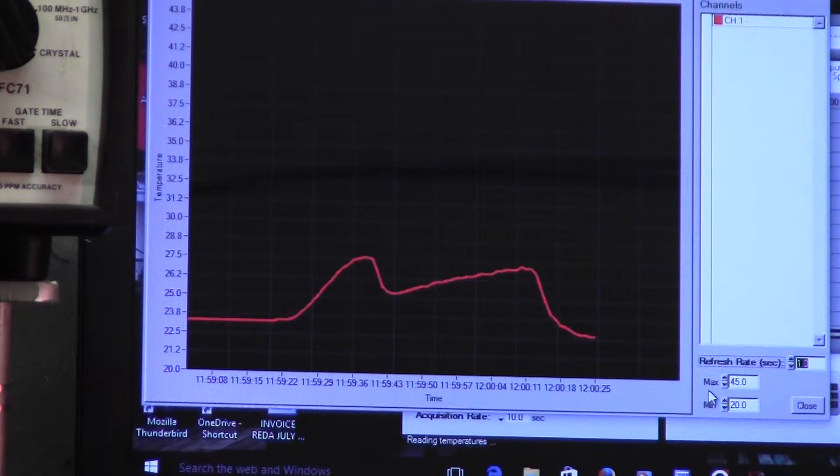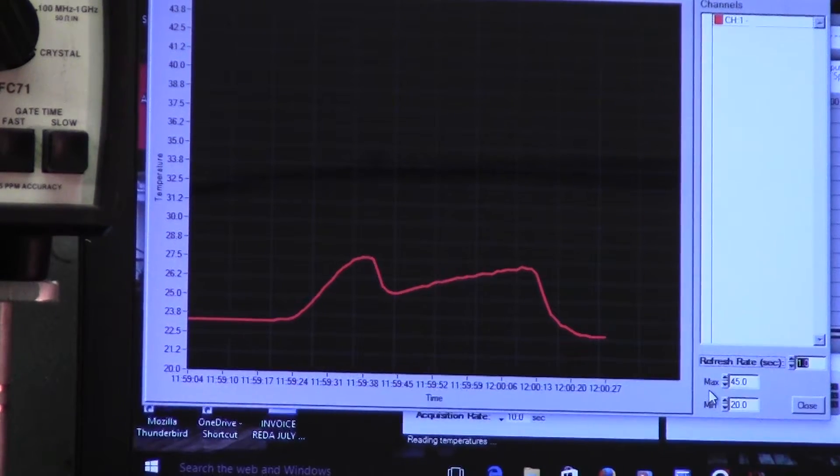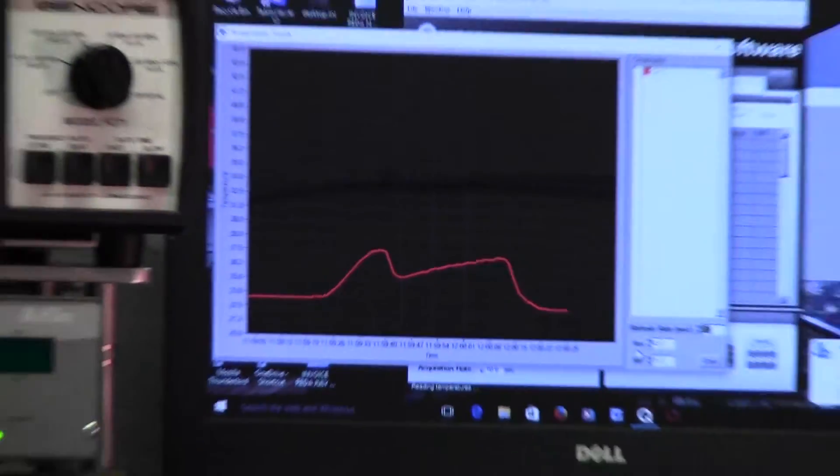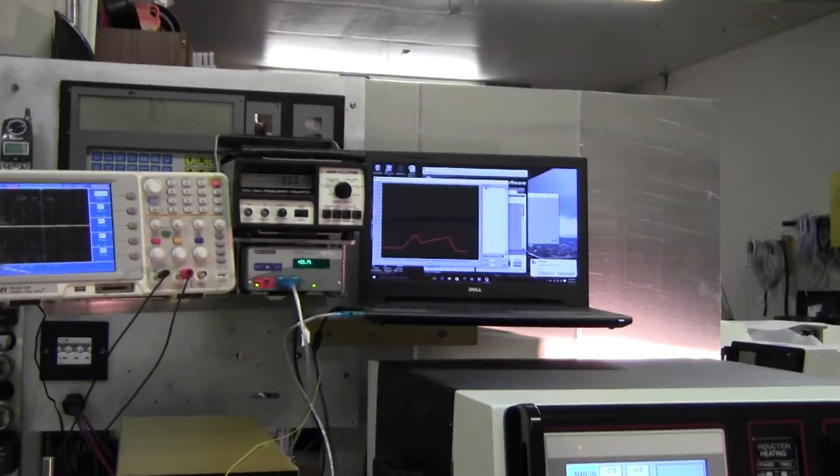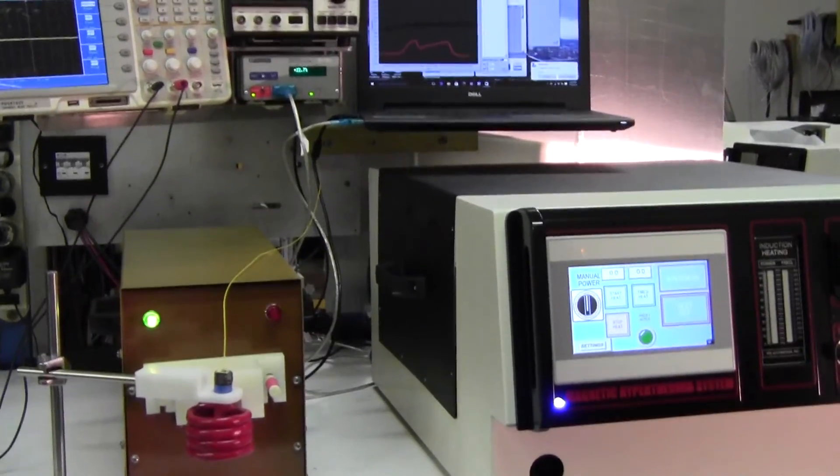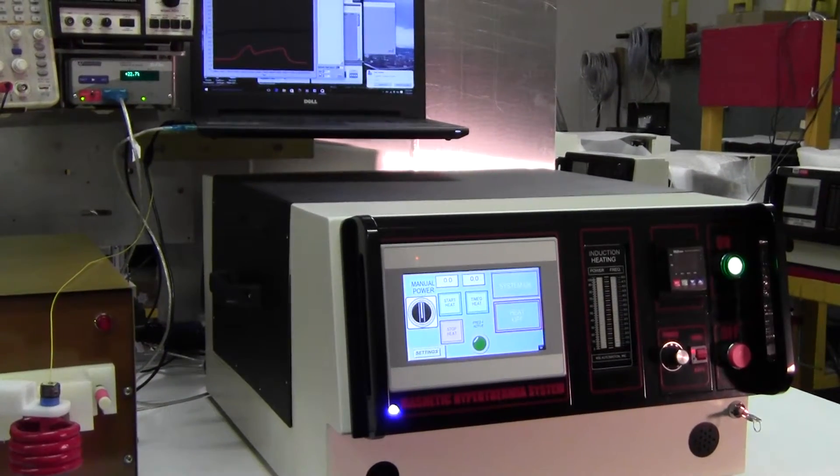Now what we'll do is we'll zoom back out, turn over here, and now we'll do it with temperature control.